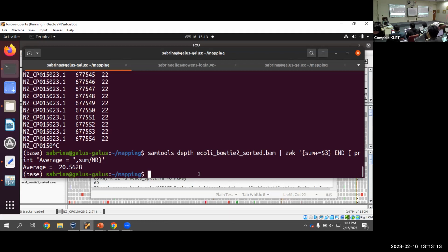Okay. So are we all on the same page now? No? So we are trying to align our 2 reads with the reference genome. So align means we are trying to map. So this is a reference mapping. Since we have the reference genome, we want to see in which position these 2 reads actually map.